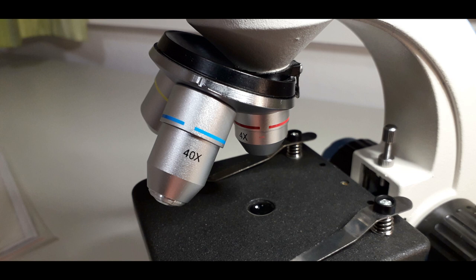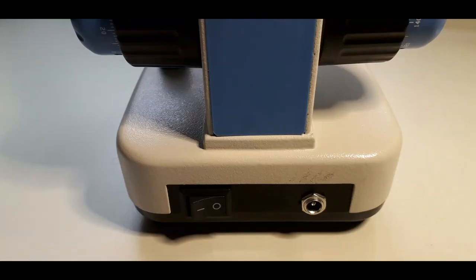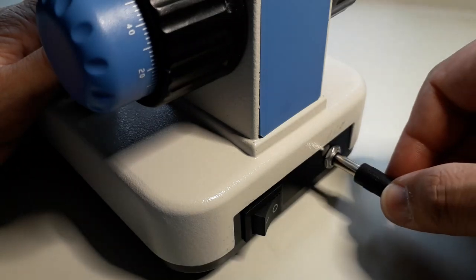Yeah, some other close-up views of the microscope here. And this is again the lamp. And the lamp is quite easily accessible because you can screw open the top. Yeah, and the back of the microscope as well. And how heavy is it? It is about 1,264 grams, so just over 1 kilogram.